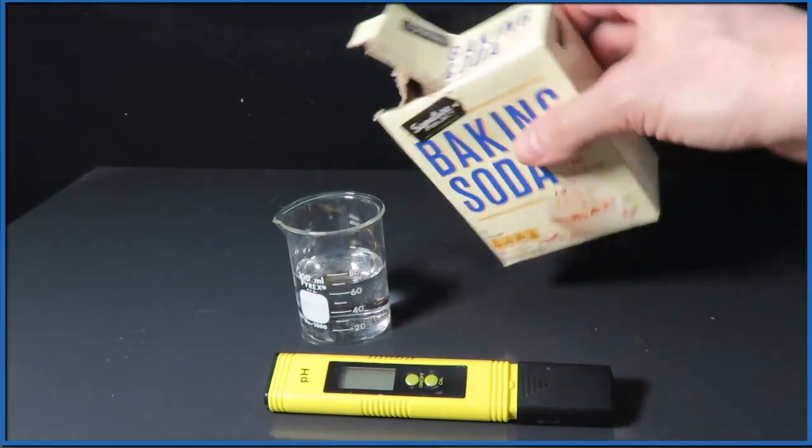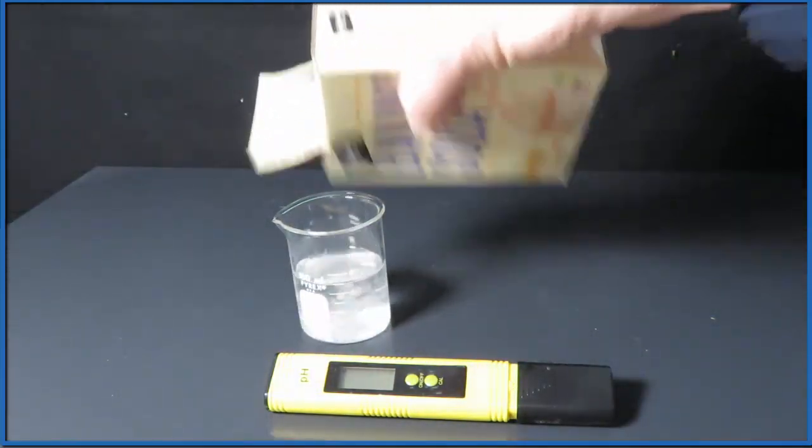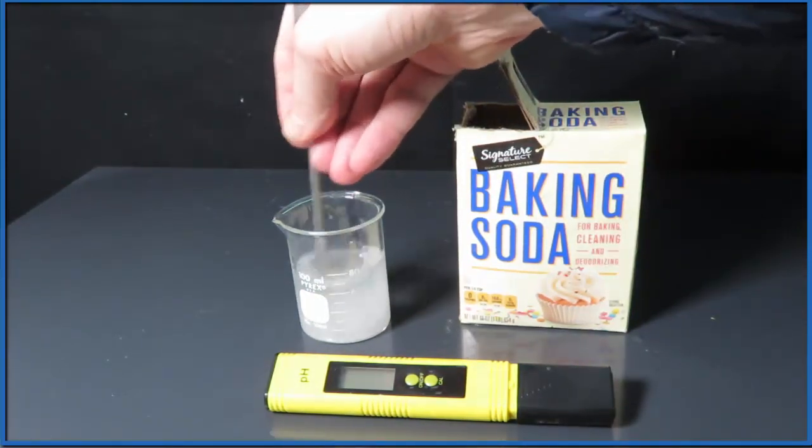We can also use a pH meter to figure out the pH more accurately. So we mix some baking soda in with the water, then we're gonna stir that up, get everything dissolved, then we'll put the pH meter in and figure out what the pH is for our baking soda.